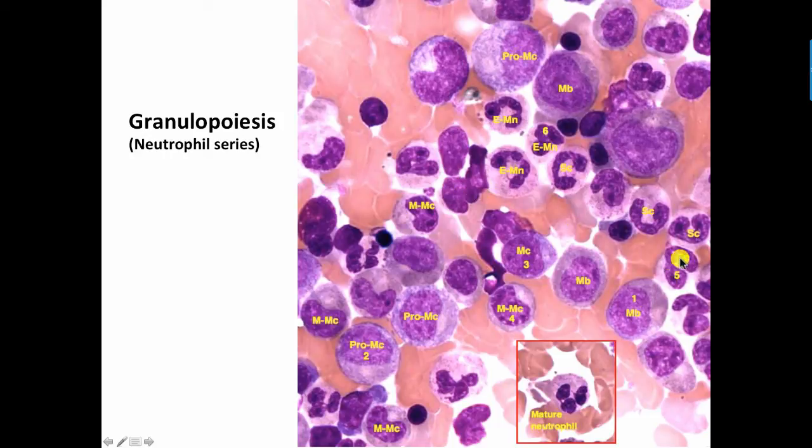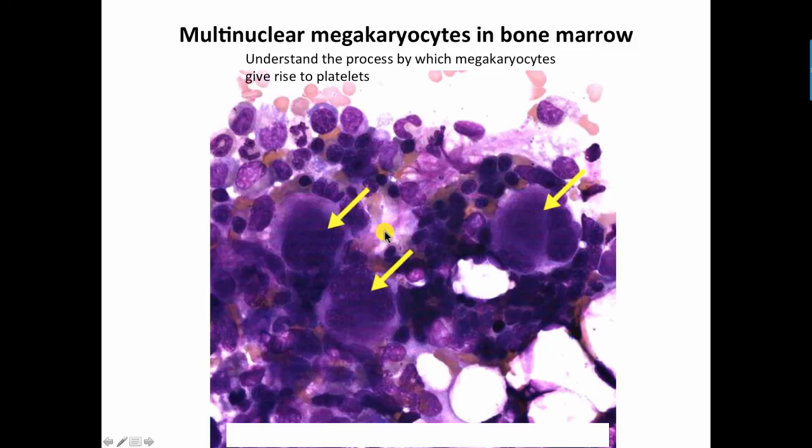With further development from a stab cell to a mature neutrophil, one sometimes sees these early mature neutrophils, but really the stage that I would want you to look at would be the transition to a mature neutrophil with a multilobulated nucleus joined together by these strands of chromatin.